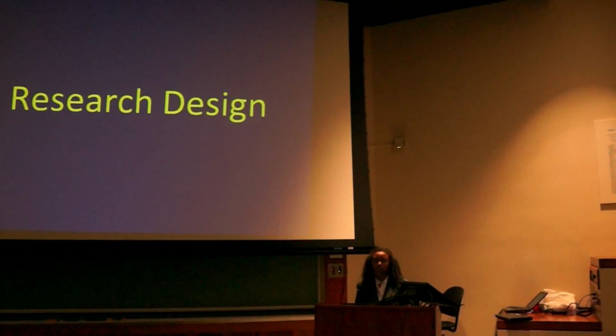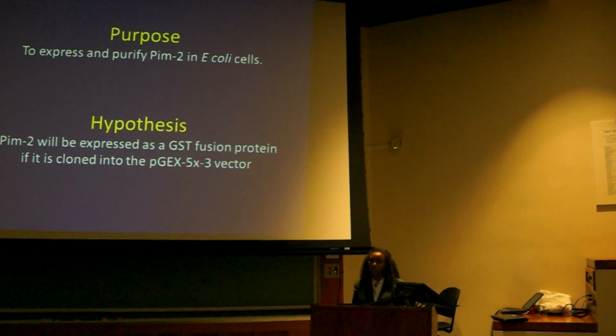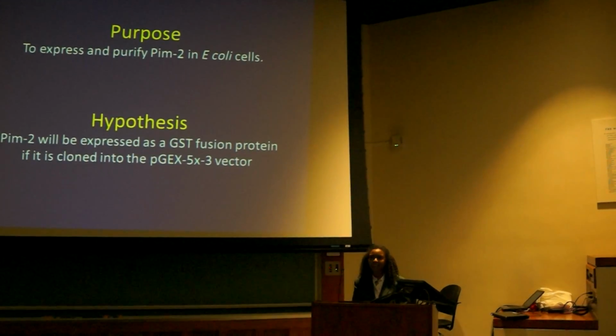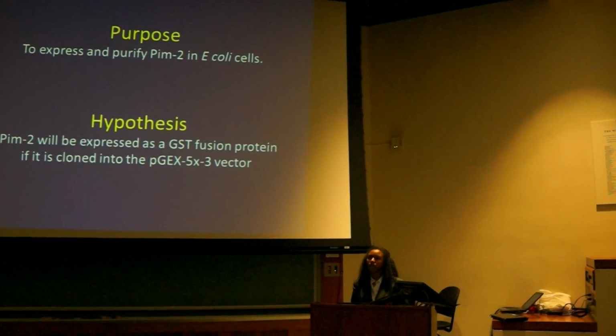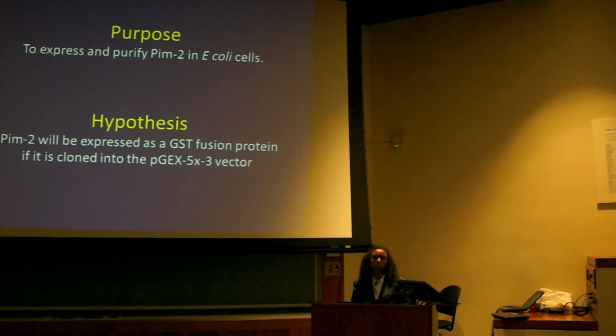This leads me to my research design. The purpose of our experiment is to express and purify PIM2 in E. coli cells. And our hypothesis is if PIM2 is cloned in a pGEX-5X-3 vector, it will be expressed as a GST fusion protein.